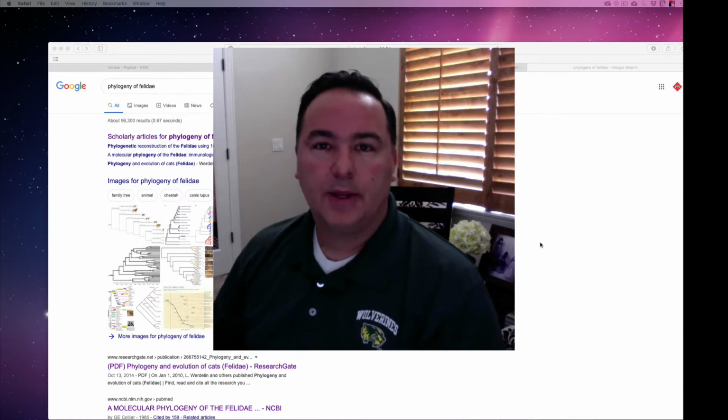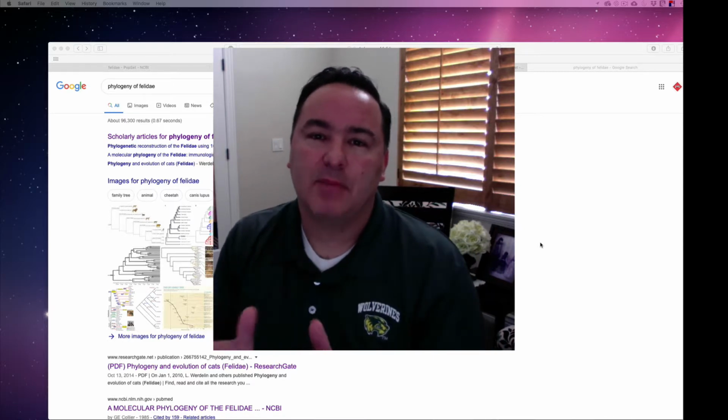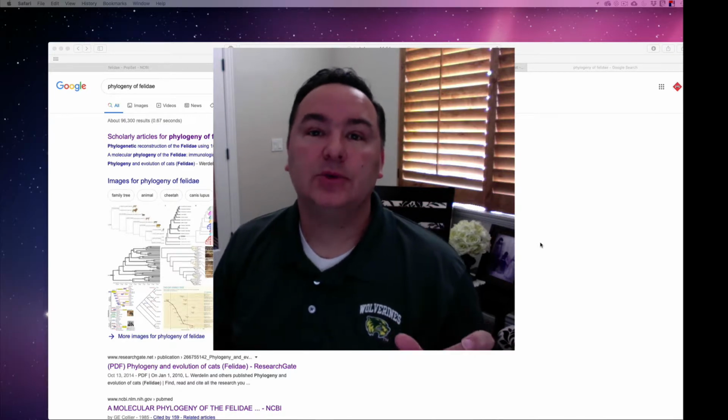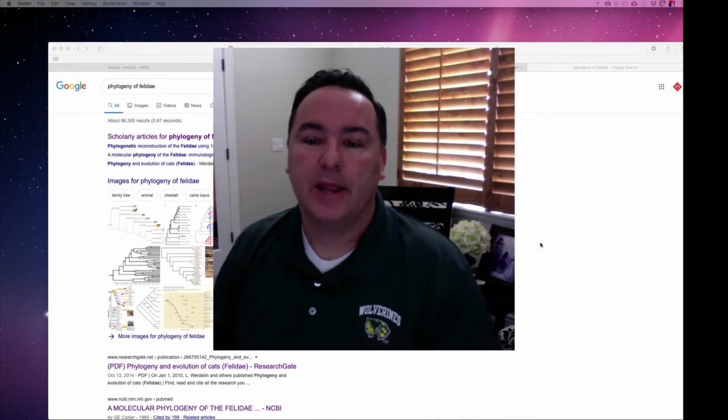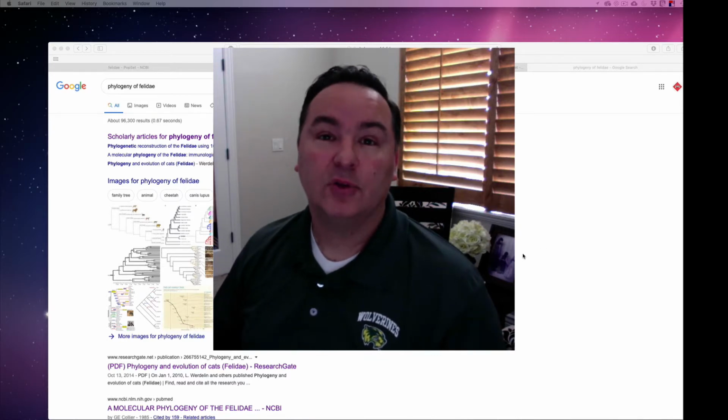Okay, so I'm going to do a quick video to do the whole process, maybe really quickly, but most of this is to show you how to combine two data files into one data file. So again, let's come back to this idea. I'm interested in the evolution of big cats.